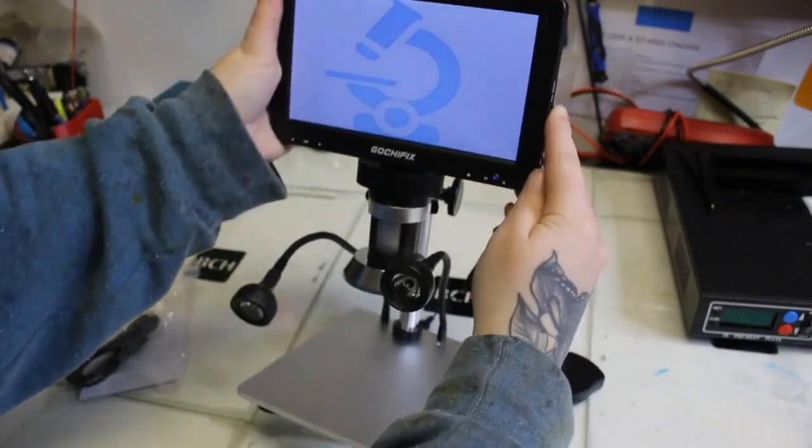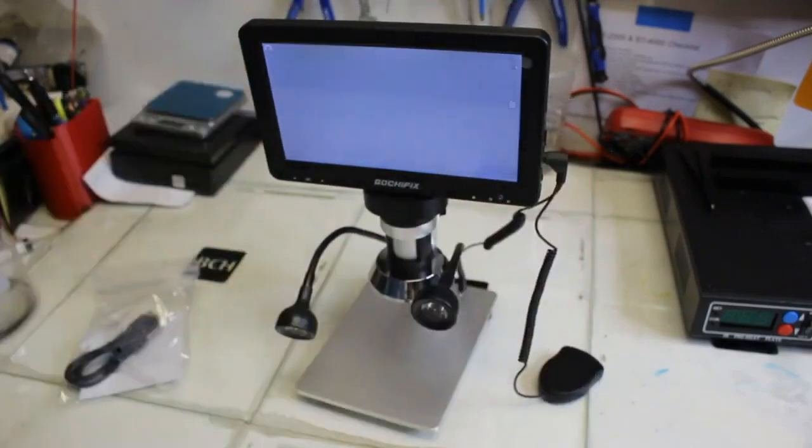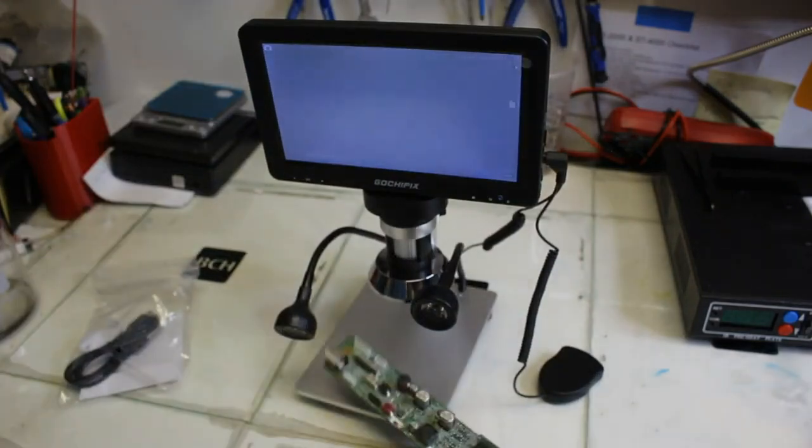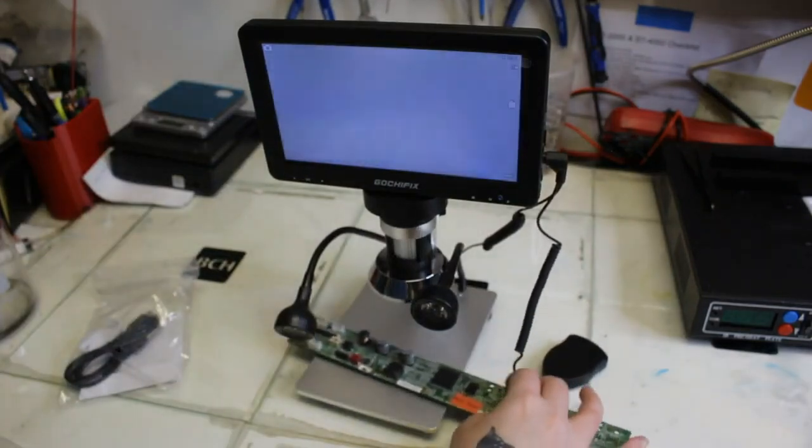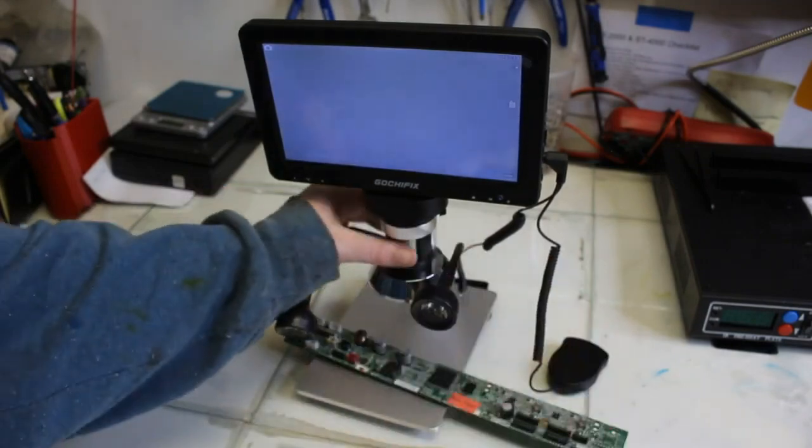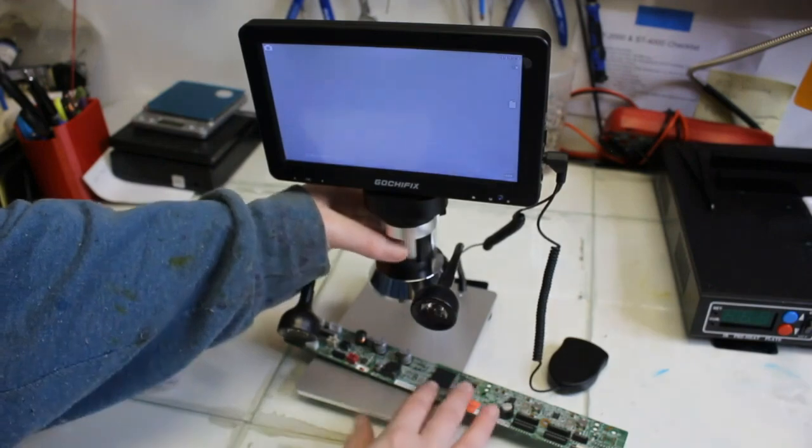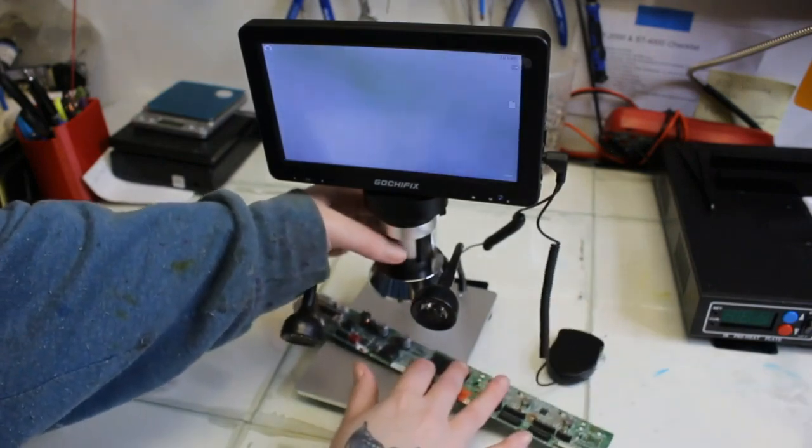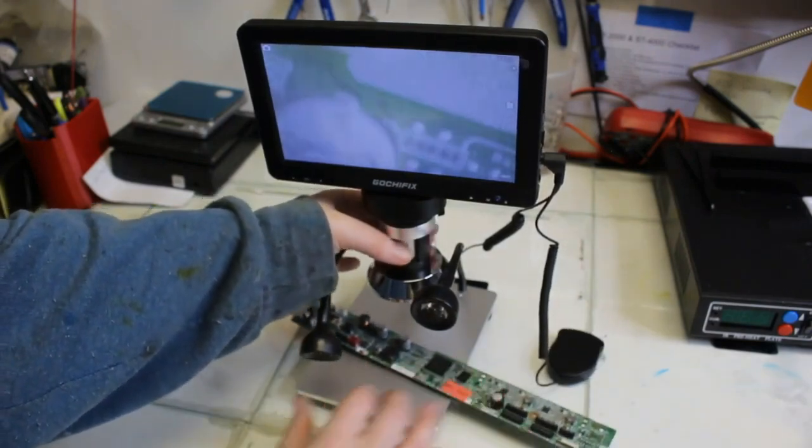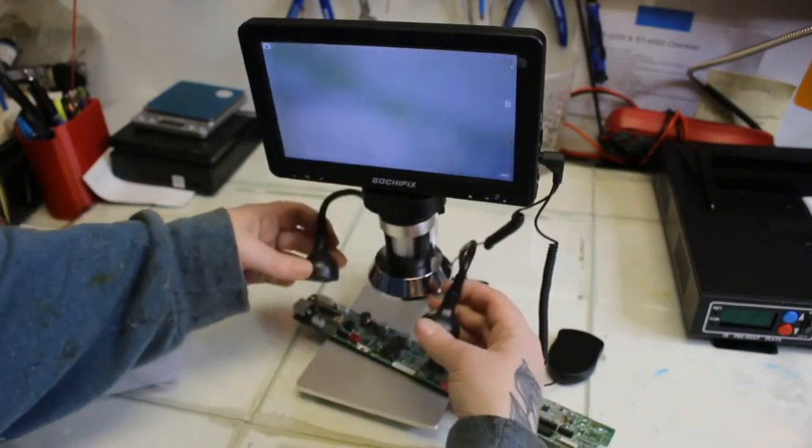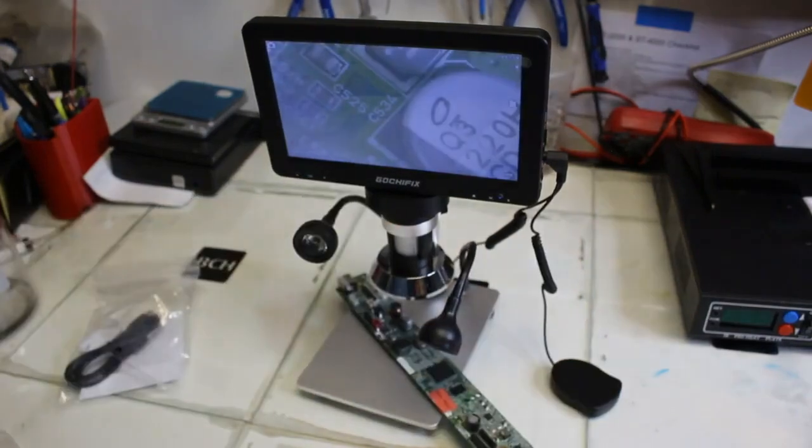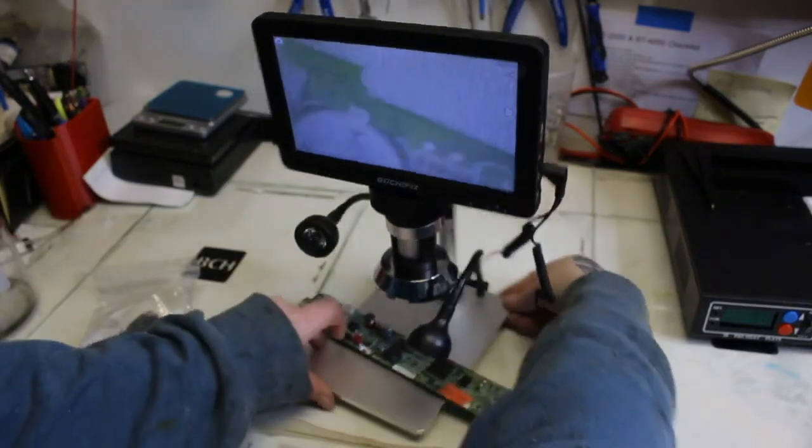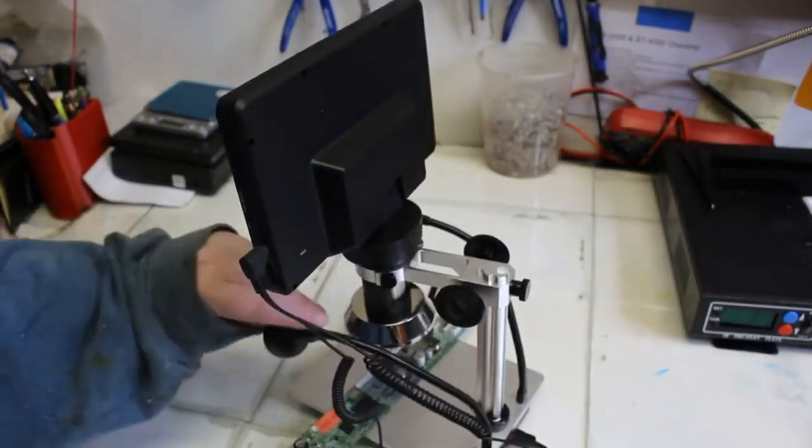Now it took me a second to find the power button. I thought originally it was just on the front of the screen. It's actually on the bottom of the screen so go ahead push that hold it for three seconds and it should power on. Now I have a main board under here so I can try to focus my lens and you'll see there's the gray bumpy roller that you see me moving my finger over. That's the focusing part of the microscope.